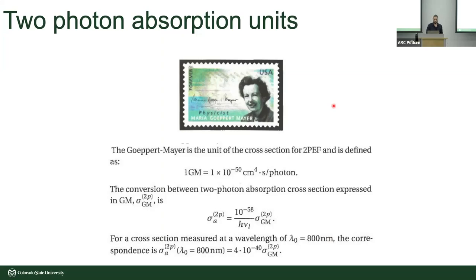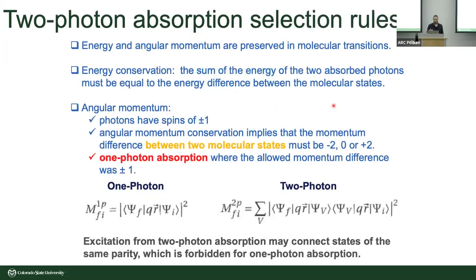I believe the first paper is from 1990. The only reason I bring this up is because the way that these quantum selection rules work, there's an important factor when we design an experiment that has to be taken into account.